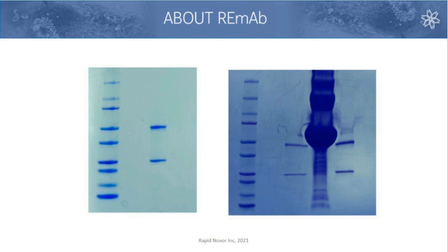We've luckily, over the past, like I said, several years, because we've sequenced so many, our team has practically memorized the sequence for BSA and many mouse proteins, and as a result, we're able to usually work through those projects as long as the dominant antibody is the antibody of interest.